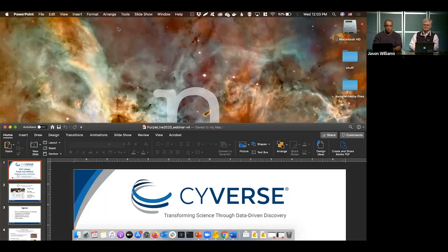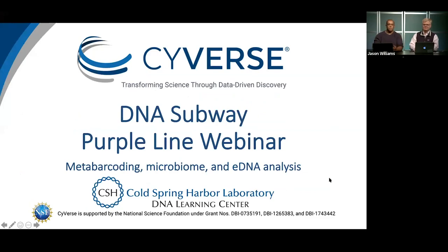Please send questions at any time. If you don't get a chance to ask during the session, you can also leave feedback on DNA Subway. We'll present a few slides for orientation and background, then do an actual live walkthrough. I'll cover data handling and project creation, and then Bruce, who has been perfecting the microbiome metabarcoding Purple Line, will take you through most of the workflow steps in detail.